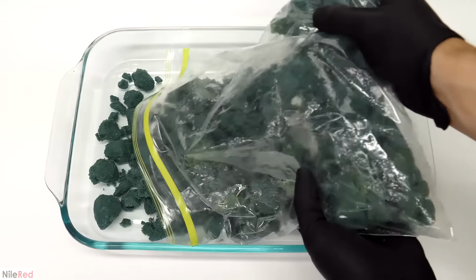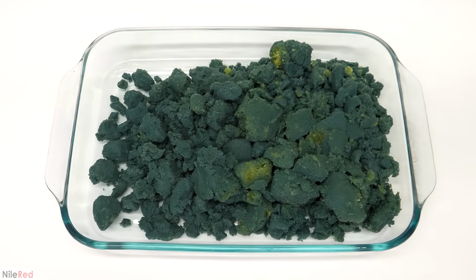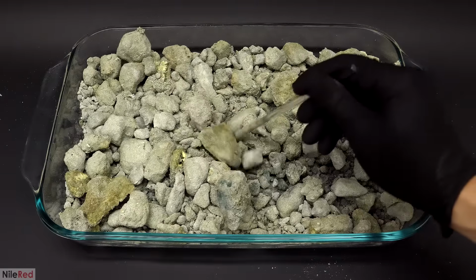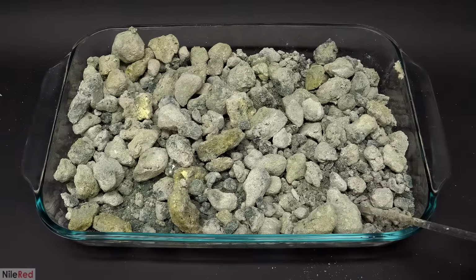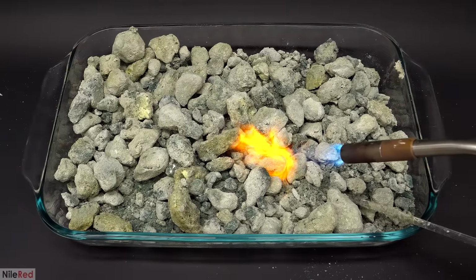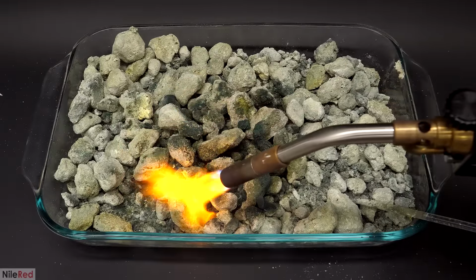When it was done, I dumped it all into a large dish, and I let it dry for a few more days. In this time, it all ended up turning white, and it seemed to be mostly dry, but it was actually still full of water. I knew this because when I shot it very quickly with a blowtorch, it all started spitting out water.